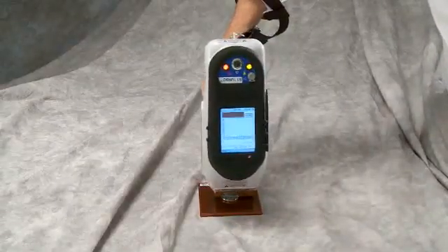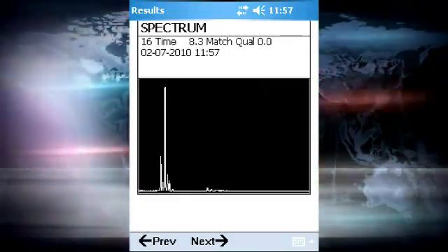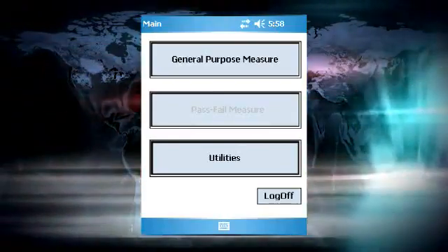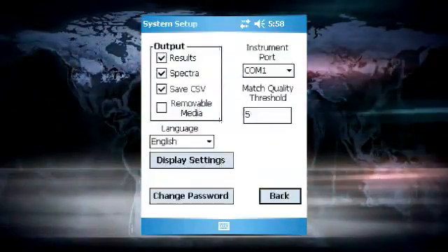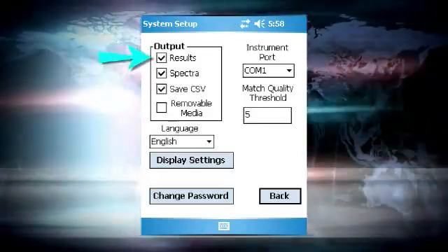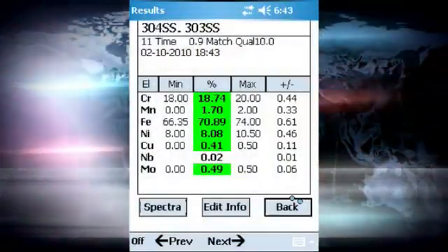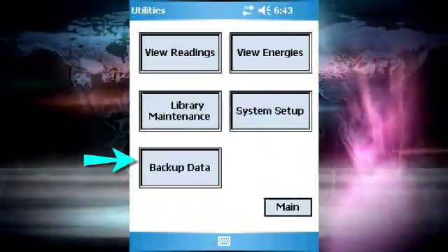There are two ways to transfer data from the analyzer. The first is to store the data on the analyzer and transfer it to the SD card with the S1 software. In order to store the data directly onto the SD card, insert the SD card into the SD card slot on the PDA. Once this has been done, go to the utility screen and tap the system setup button. In the system setup screen, you can choose if you want to save spectra by checking the box next to spectra. Make sure the box next to results is checked, and finally check the box next to removable media — this will result in all the data being stored on the SD card. The other alternative is to transfer data from the PDA memory to the SD card by tapping the backup data button on the utility menu.